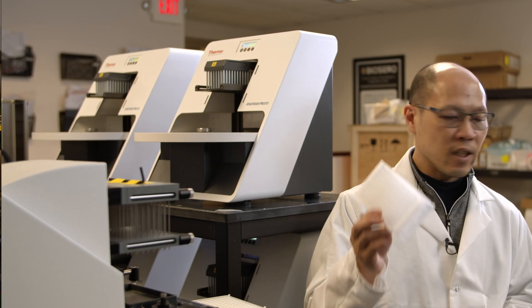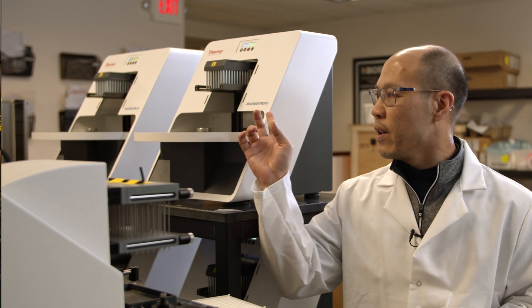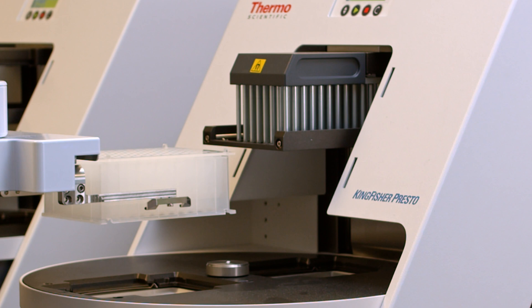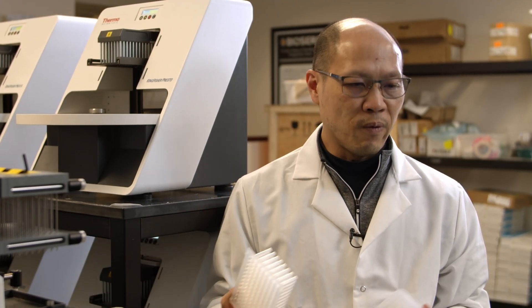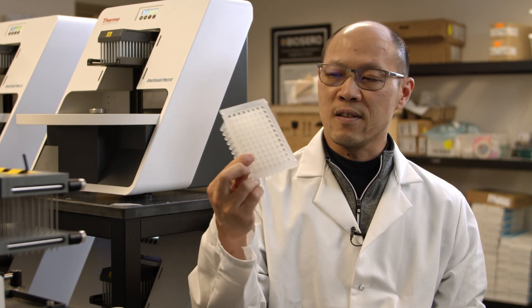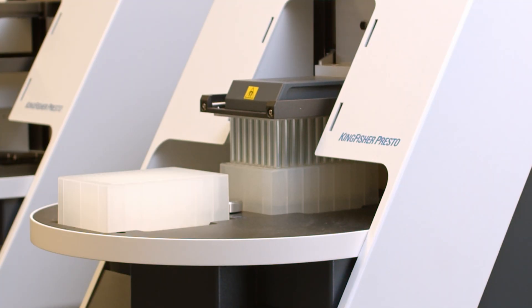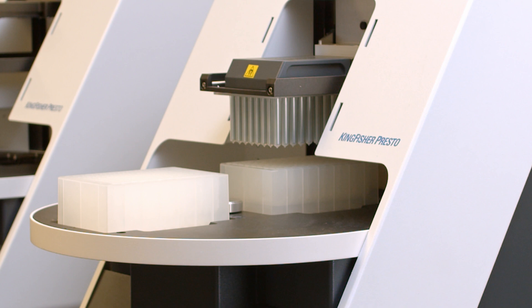Magnetic beads will be added to the sample itself. And with this instrumentation here, there are magnets — one for each well of this plate. To make sure that the actual physical binding of the magnetic beads to the magnet are not permanent, there is a sleeve here, called a comb, that will allow the magnets to be separate from the sample itself.